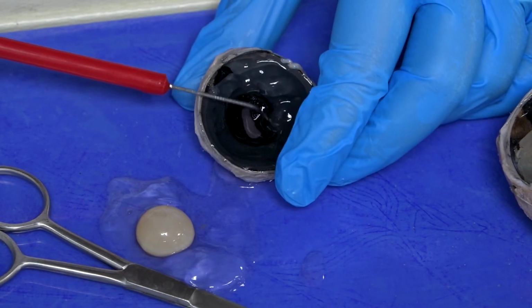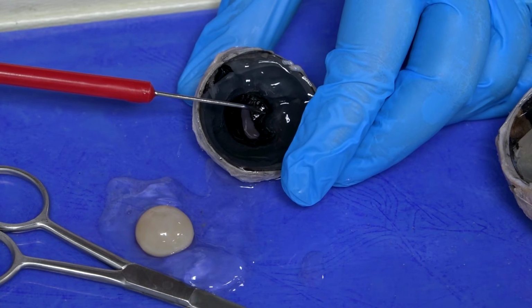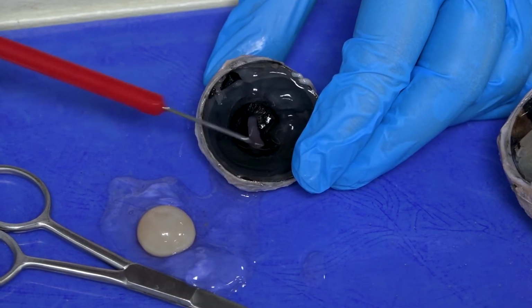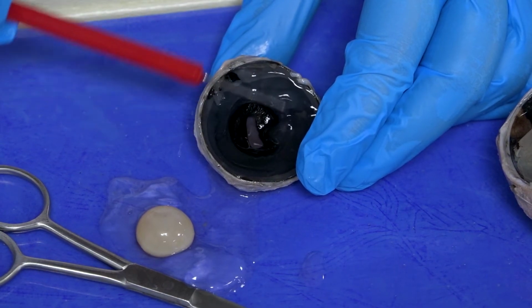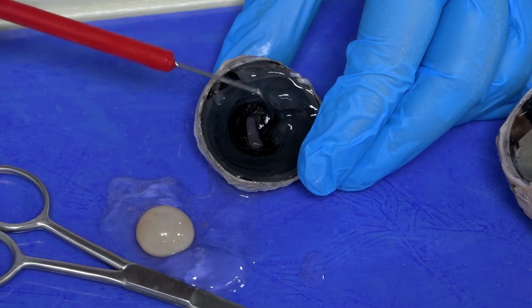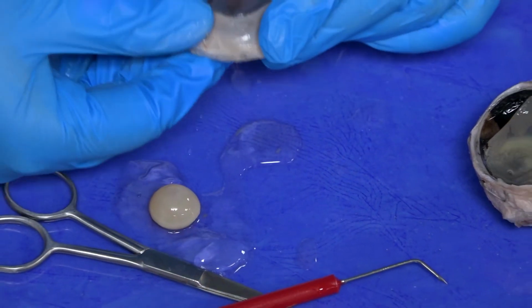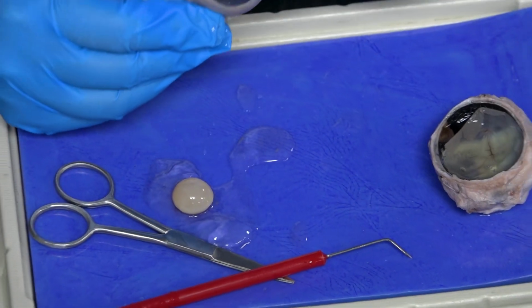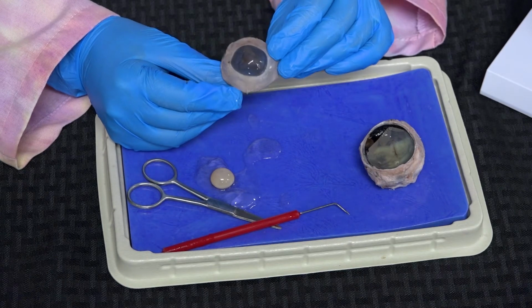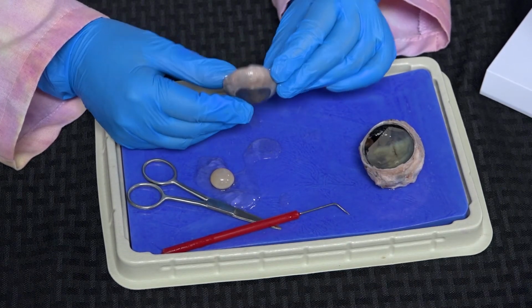You can see, kind of surrounding the pupil, is the iris, that in the case of the cow eye is brown colored tissue. And then the layer of muscle that held that lens in place and changed its shape is here. Perfect. So that's the top part of the eye, and I'll show it to you again. Now that I've popped the lens out of place, you can probably see the pupil a little bit more clearly. Some of the tissue changes texture and color a little bit because of the preservative, but you get the gist of it.